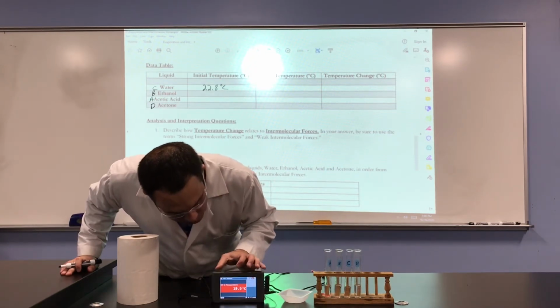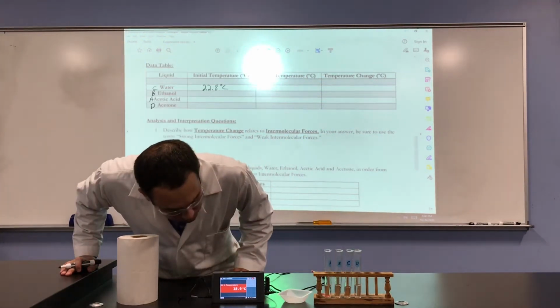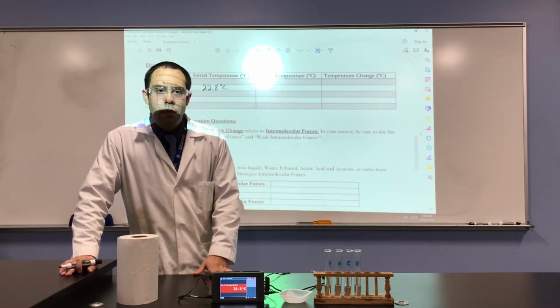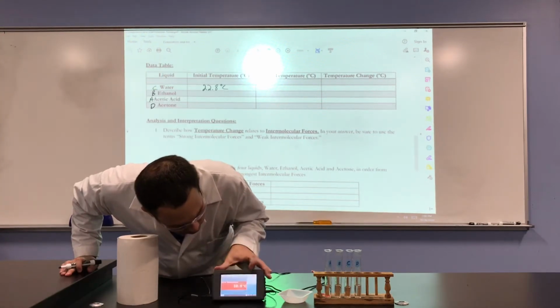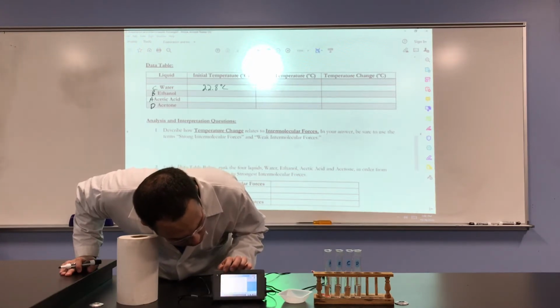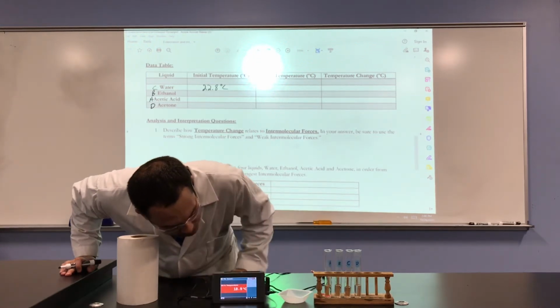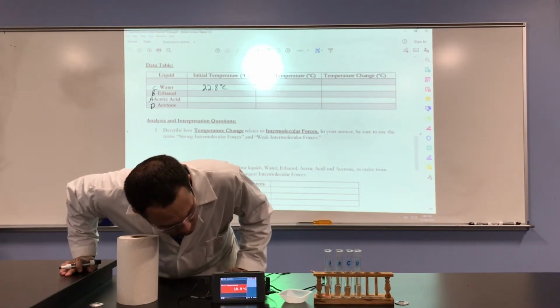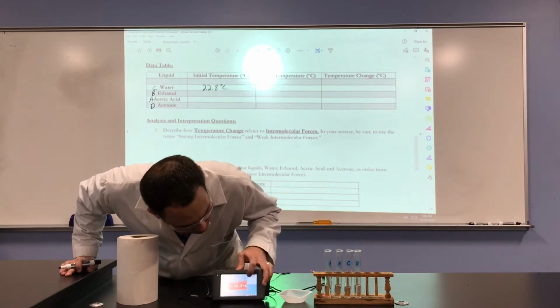So hovering around 19.0, 18.9, we're at 130 seconds in, so less than 1 minute left. 18.9, we haven't moved from. 19.0. 18.8, we got 18.7 for a brief moment.